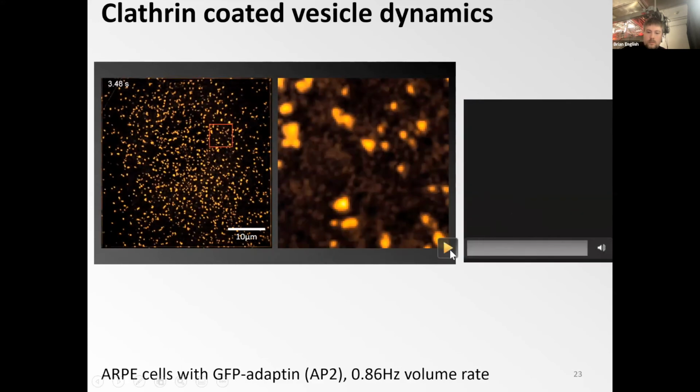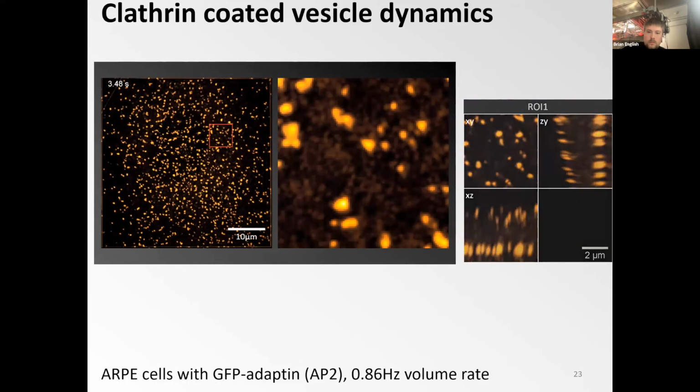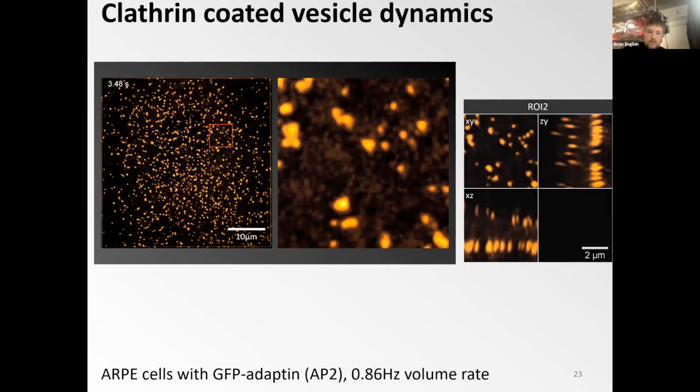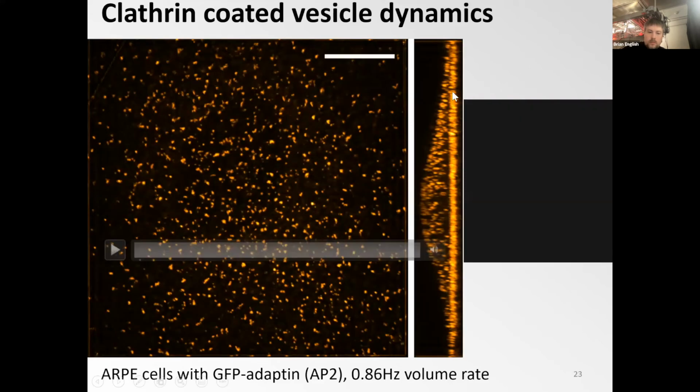from either side of the membrane and actually move in 3D, which is something you couldn't do if you were, for example, using TIRF microscopy, which is popular in studying clathrin-mediated endocytosis. There you would get only the bottom of the cell, and if a vesicle takes off, it leaves the evanescent field, and you wouldn't know if the vesicle has disassembled or if it has just relocated out of the TIRF layer. And in principle, with the OPSIM, we argue you could now study this over the entire cell, and as such, you in principle wouldn't lose a vesicle leaving your depth of focus.